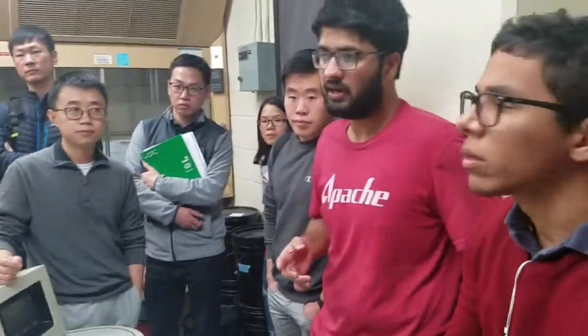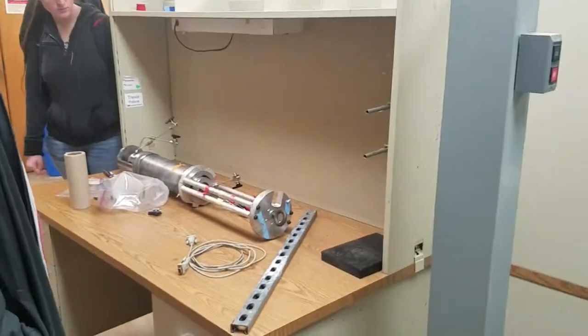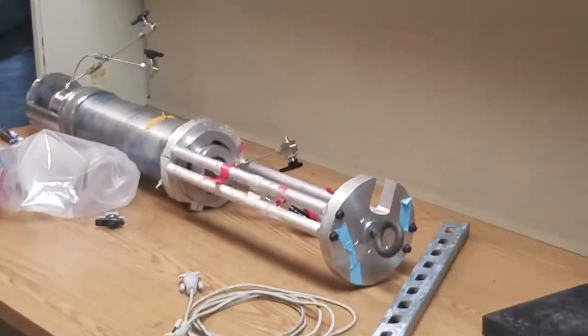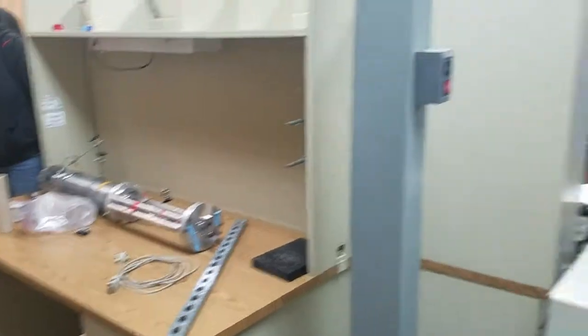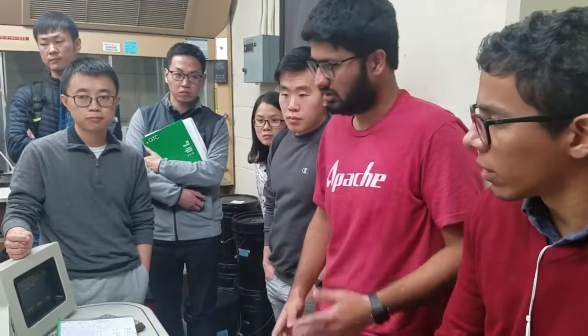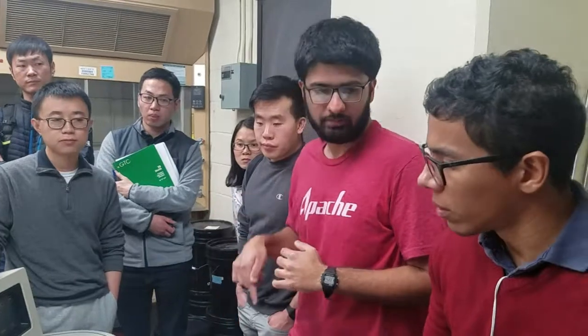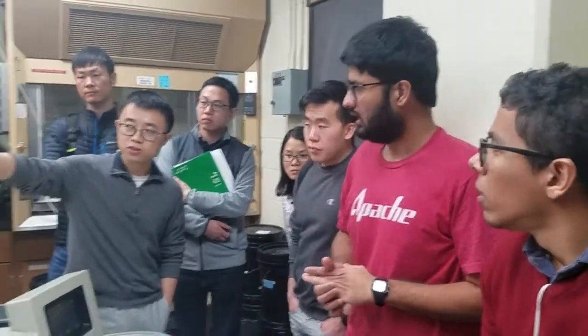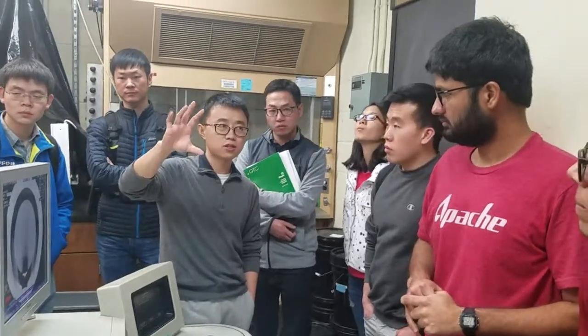Yeah, there are multiple sizes. Most of the people that run their experiments design their own setup. There's another, smaller one here on the table. So this is smaller than that. Basically you can modify it and get a smaller one based on your needs. But there is a maximum weight limit on the machine. The vertical positioning system can only handle a maximum weight, so as long as we don't go above that, it's fine. That is one constraint and the length is another, because you might hit the bottom part. And that one is almost hitting the bottom.